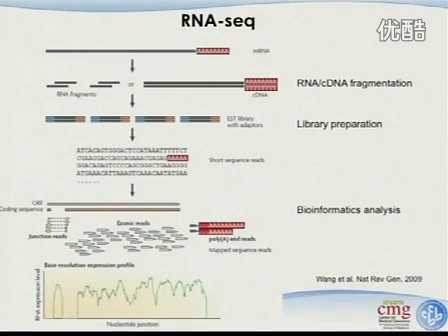How do you use the poly A? We don't do that regularly because our reads are in general pretty short, like 36 or 50 base pairs. But once you go to 100-something base pairs, if you have an extensive chunk of poly A, you can first find those reads and where the poly A starts, right?